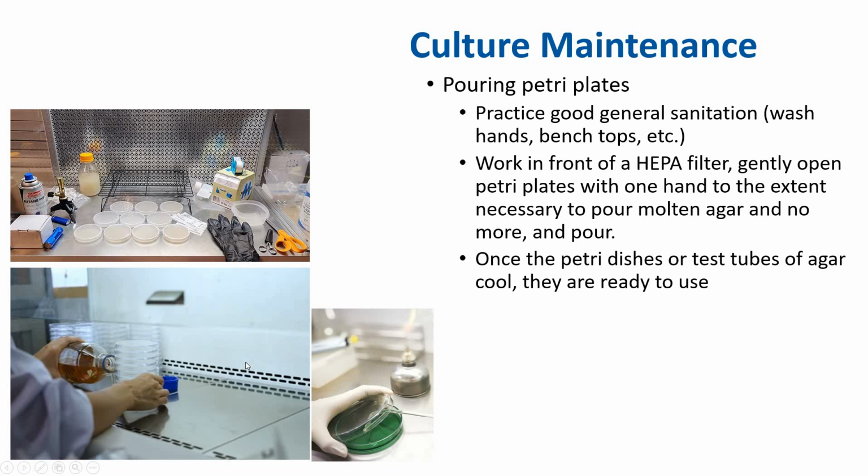So once the petri dish or the test tube of agar is cool enough, they're ready to use. To transfer it, you open up the lid slightly, you pour the medium in there, and once the petri dish or the test tube of agar is cool, they are ready to use right away.